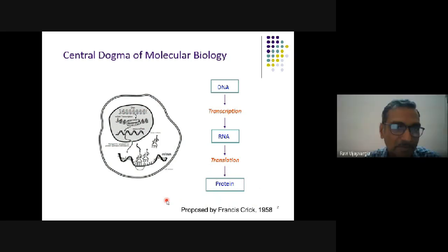So sometimes you do want to purify protein from an endogenous source, but a lot of times for commercial or therapeutic use, we express the protein in higher amounts using recombinant DNA technology, by cloning the gene and using a strong promoter, and then we get more protein. So the protein can still be 1 in 25,000, but the expression level is so high that it is much easier to purify it, compared to the endogenous level. So there, recombinant DNA technology comes to our help.